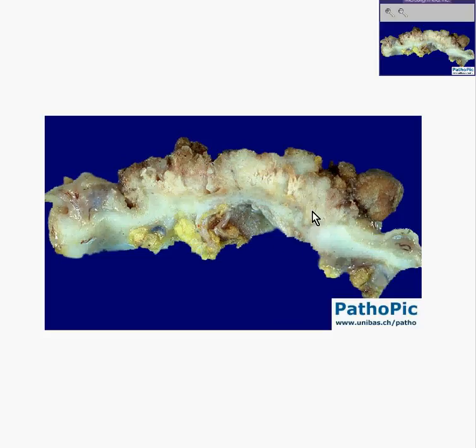All of the stuff here on top, on the north, is the mucosa. Note that we have a uniform rim of mucosa here. We have an abundant amount of soft, yellowish, fatty, vascular submucosa. We have a good amount of uniform wall, or the muscular layer. And then we have looser connective tissue and fat.